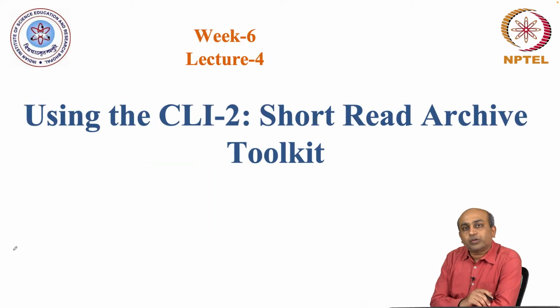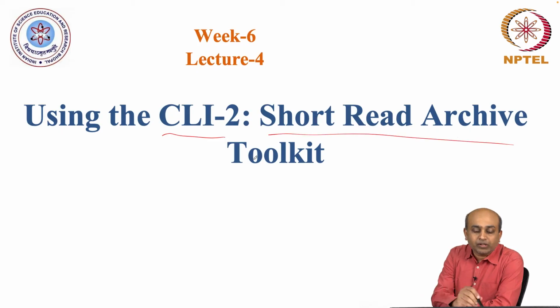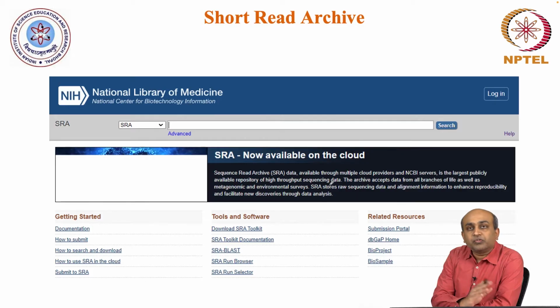So we'll continue with the demonstration of using the command line interface in this lecture as well, but we'll focus on the Short Read Archive and the toolkit that is associated with it. It's also known as the SRA toolkit. Right? So before we go into the SRA toolkit, a little bit of background about the Short Read Archive, or SRA.